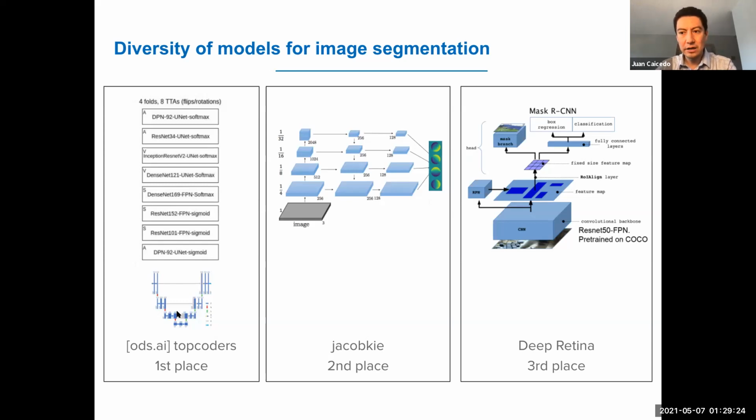It's a very simple architecture. The innovation here is not so much the architecture, because it's also pretty old and kind of simple as well. The innovation that they made is that they replicated this exact architecture in 32 different models, because you can choose how many layers or how many filters or what's the resolution of each.